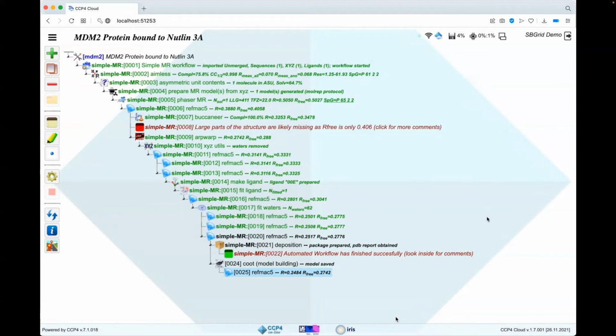For example, many, if not most, problems in crystallography arise from the suboptimal quality of reflection data. And reflection data was merged and scaled here in job number 2 aimless. Suppose I want to rerun this job and all the rest with the updated data set. So I can clone this job number 2, adjust parameters, and run it, making sure it is kept in automatic mode. This is how it is done.